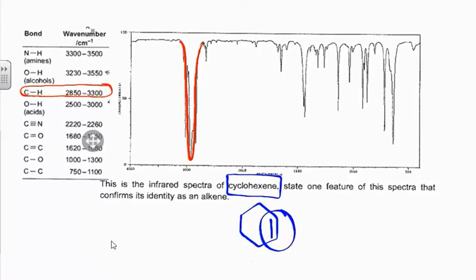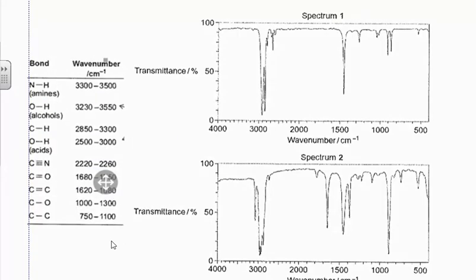Let's find that on the data sheet. There it is. Very close to the carbon-oxygen double bond. We just need to be careful if we've got something with one of those in, but fairly small absorption compared to some of the others, but there it is. I've highlighted it in blue, coming in around about 1650, showing us that we've got an alkene.